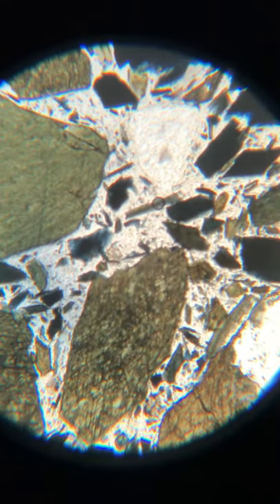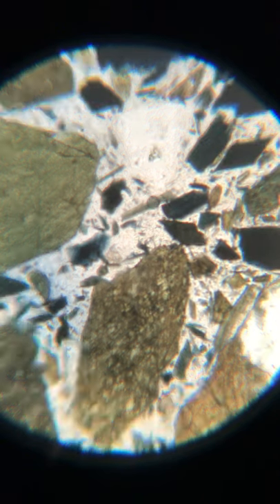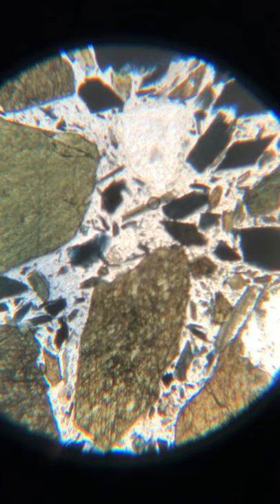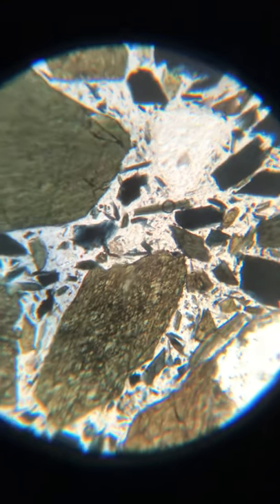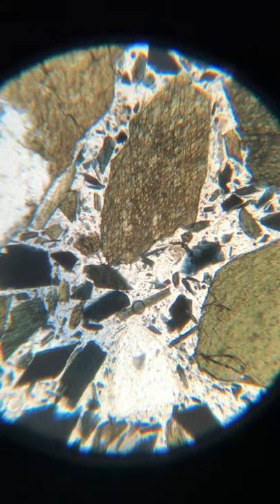Look at this one. You should be able to see — there we go — two directions of cleavage. This is in plain polarized light.